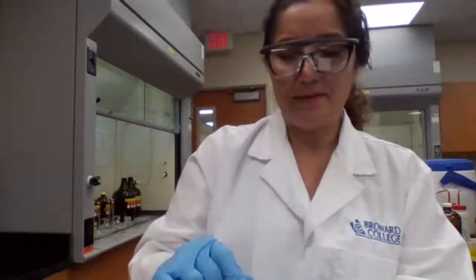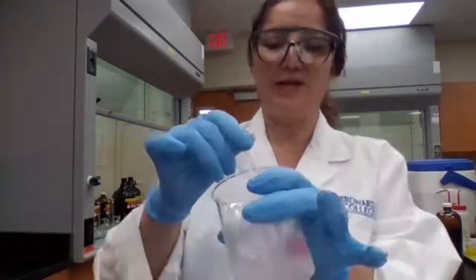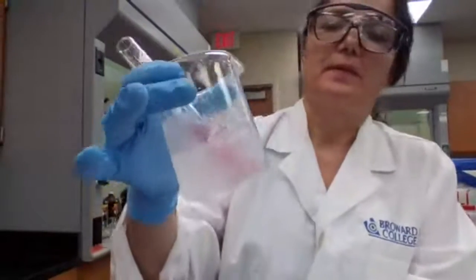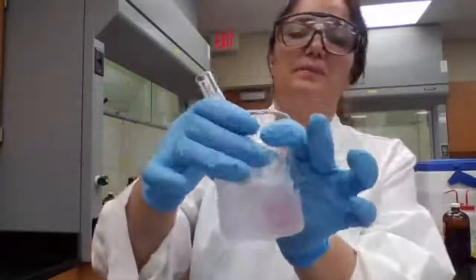Heating it up, it changed to blue color. So if the product is blue, that means heating up the reaction made it go to the product side. Placing in ice, it changes back to pink color.